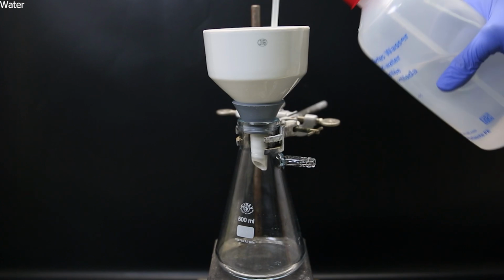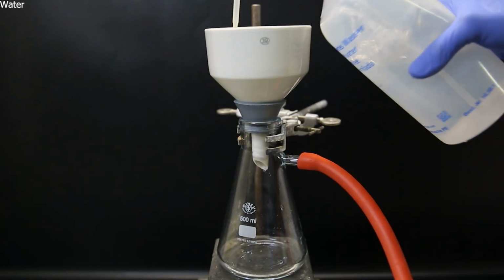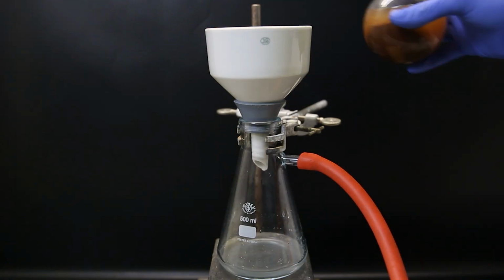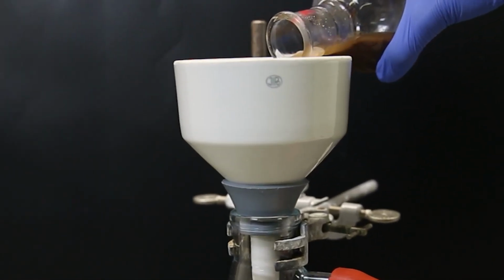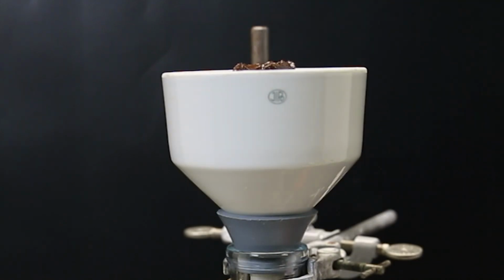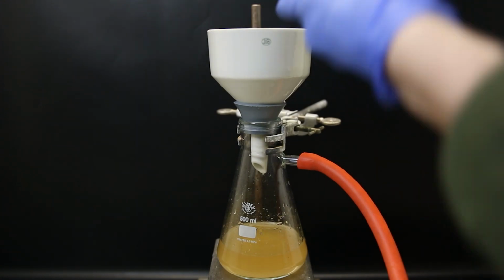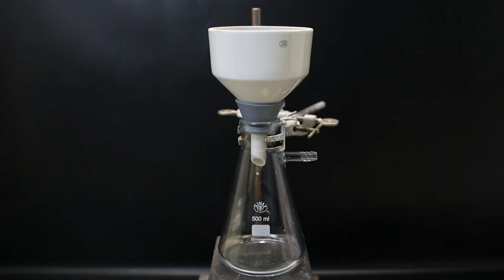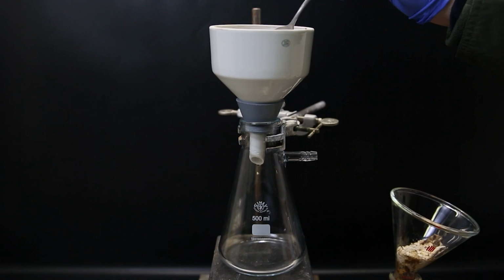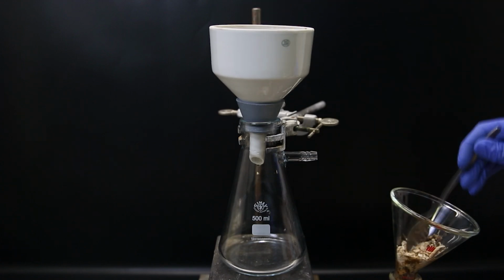I wet the filter paper with water and add a layer of Celite on top. I wet the Celite with water and then filter all of the mixture through. I wash it with some more water, and when it has all filtered through, I discard the filtrate and then scrape off the top layer of Celite that contains the brown residue, and put it all into a flask.